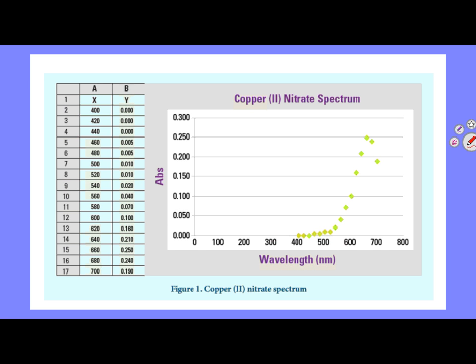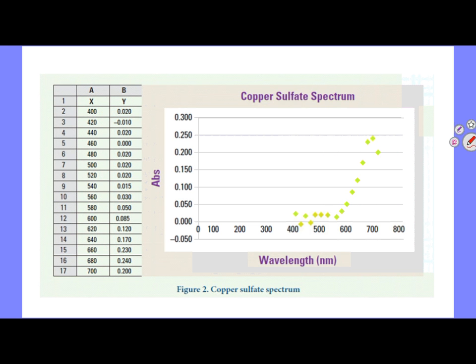No, because copper(II) is blue. Nitrate is clear, okay? With copper being the commonality, the absorption still peaks at around 650, 670. So sulfate, what color was sulfate? Clear, okay? So the only things that we're going to be using for absorption are things that have color to them. Clear stuff is going to let the transmission go 100%, absorption goes to 0.